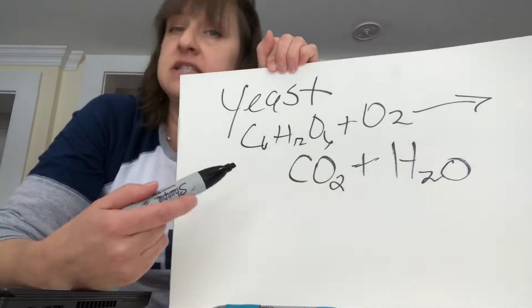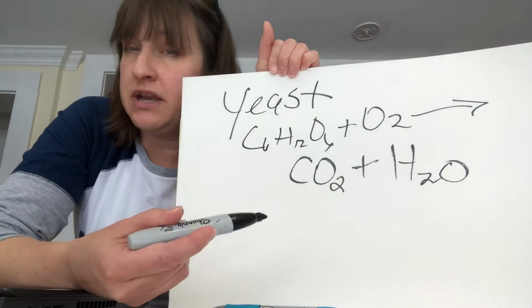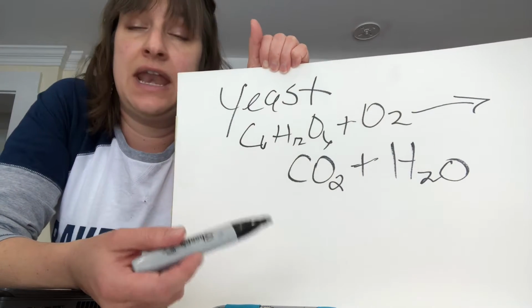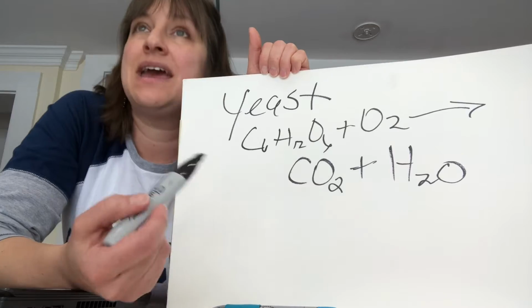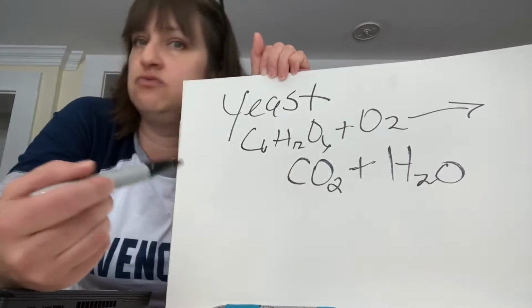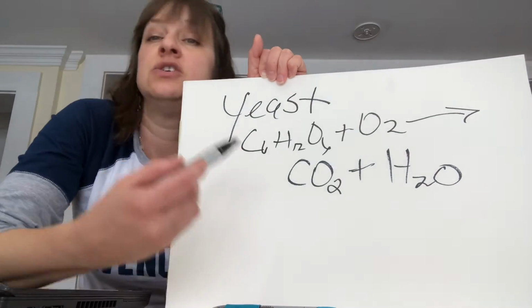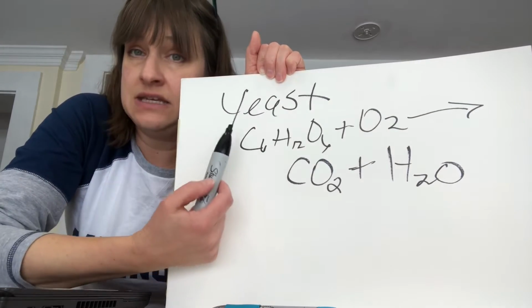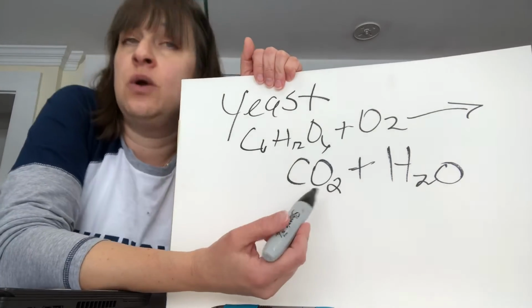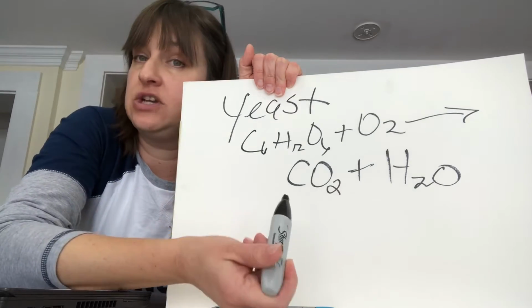So this is the process that yeast does. It's called cellular respiration. The byproduct of this, or the byproduct is probably not the best word, the reason it happens, is it makes energy. And it's energy for all those other things that the cell's got to do: grow, reproduce, all of that is provided from this process. So we are going to be looking at yeast and sugar in a solution, and we are going to provide evidence in our experiment that cellular respiration has occurred.